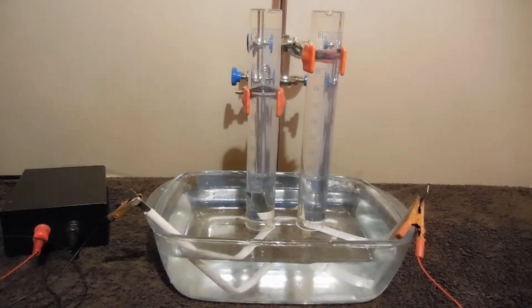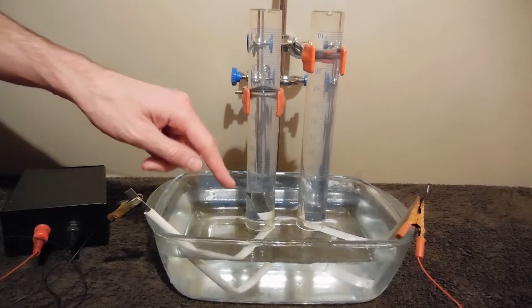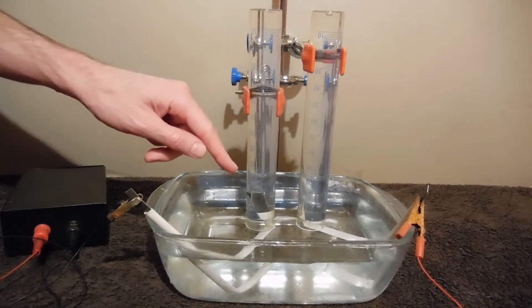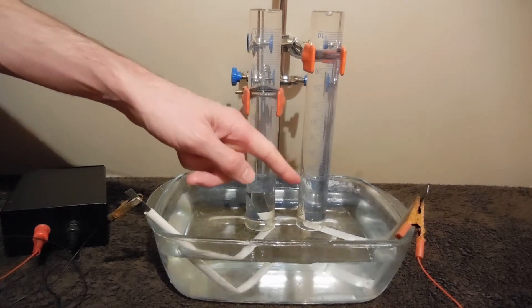Hello. In this experiment I will show you electrolysis of water with zinc electrodes. On the left there is the negative electrode. In this graduated cylinder there will be collected hydrogen gas. On the right there is the positive electrode.